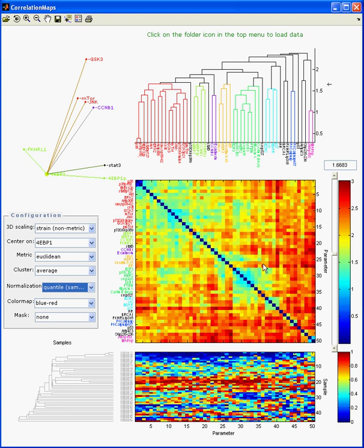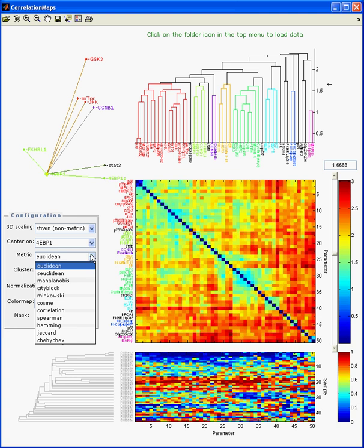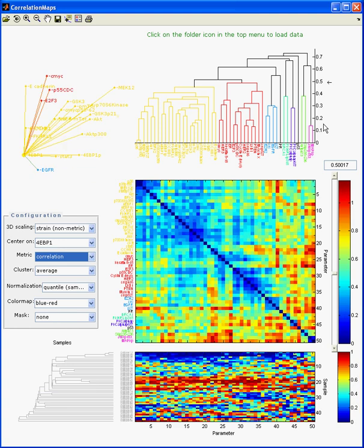In the middle, we have that cross-tabulation of correlation coefficients that you, Gordon, did manually last time we talked. There are lots of other features here I'm not going to cover — you could actually save this in Excel or as a PDF, print it out, and so on. Last time you didn't use a Euclidean distance metric, you used Pearson's correlation coefficient. So there we are — and now you see the clusters better defined. So to summarize: cluster analysis of the samples, the values themselves with normalization if selected, and the cross-tabulation of parameter versus parameter — pairwise association measured by a metric of your choice.